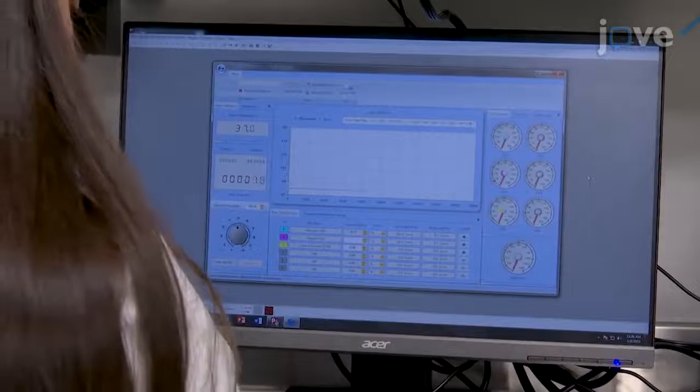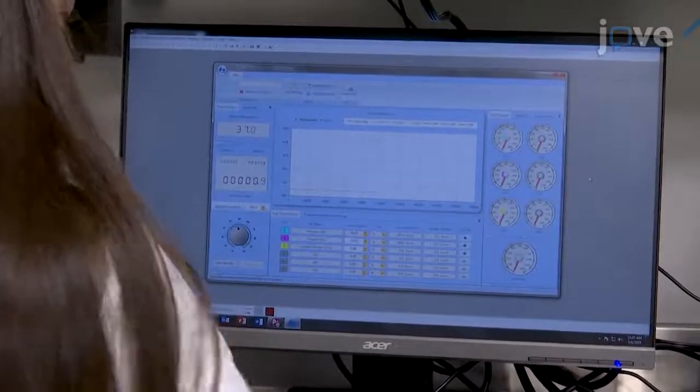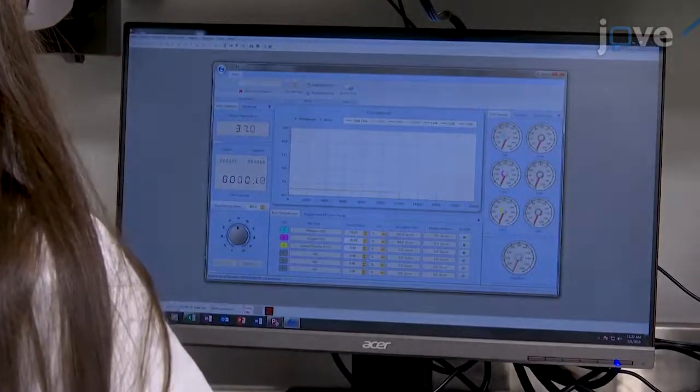To calibrate the metabolic analyzer, in the gas mixer program, set the gas mixer to 20.93% oxygen and 79.07% nitrogen.